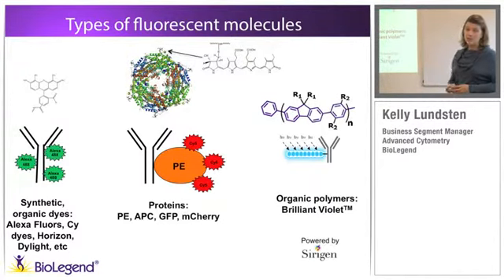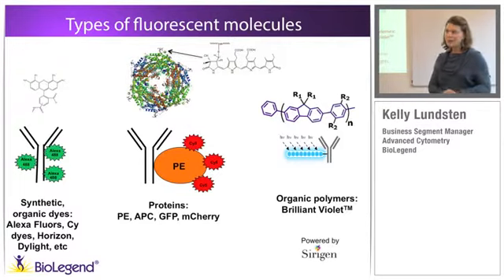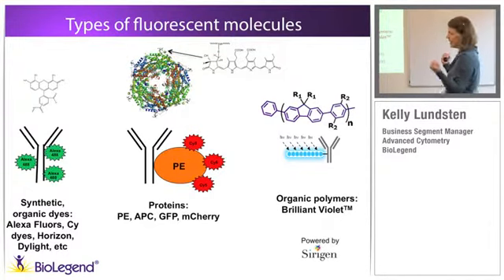However, because it is a protein, and that protein is essential to the fluorophore, it can be denatured, whether by freezing and thawing, which any protein, including your skin, is extremely sensitive to, and your PE is no different, or by any organic solvents like methanol, which can collapse that rigidity.